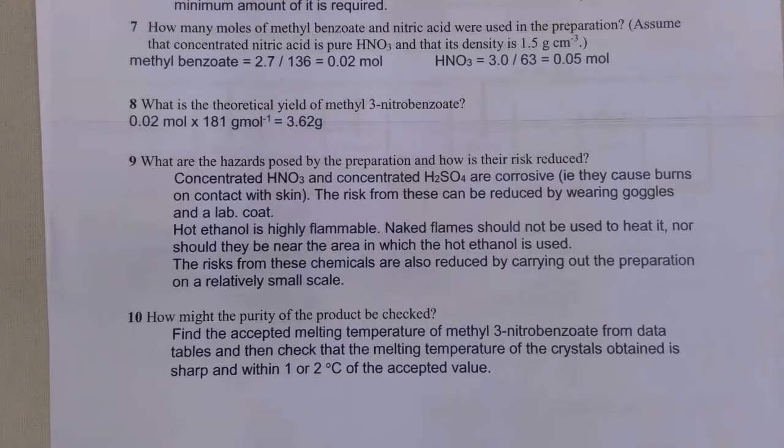Finally, the purity of the product can be checked by doing a melting point analysis. So we want the melting point of our pure crystals to be sharp and to be within a few degrees of the accepted values. And we're going to be looking at melting point determination in a later topic. So that just finishes this little video looking at the nitration of methyl benzoate.